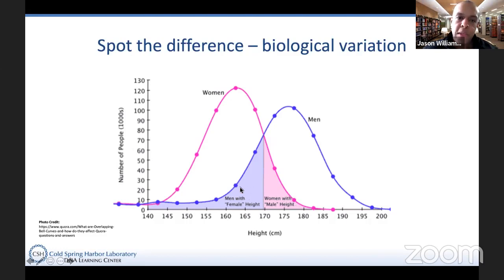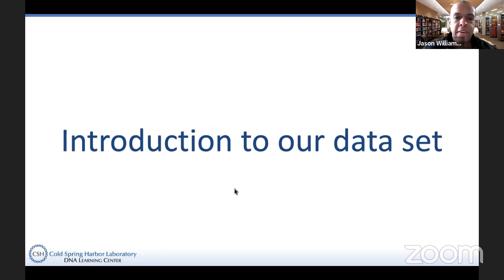So the statistical thing in the RNA-Seq experiment, one of the things that makes it a little bit complex, is we need to be able to separate these things out nicely so that we look at gene expression in a cancer cell and we convince ourselves that the gene expression might be much higher or much lower because we're looking at a cancer cell, versus it just happens to be that one individual tumor sample was different from another just by chance.